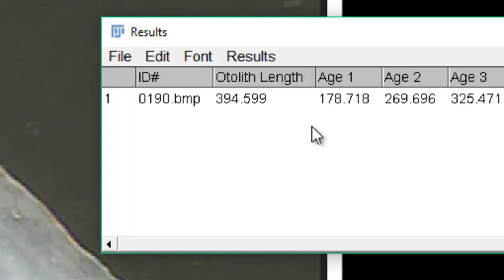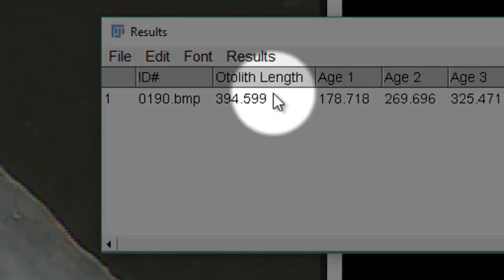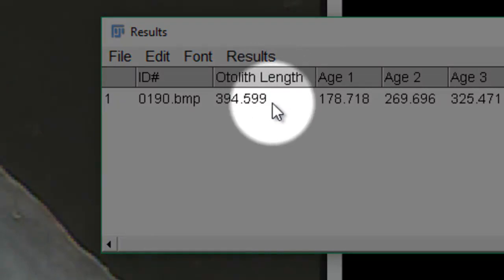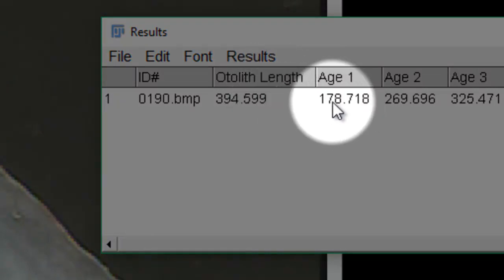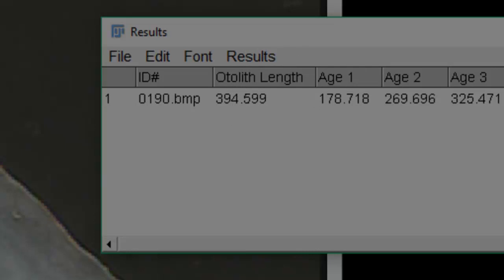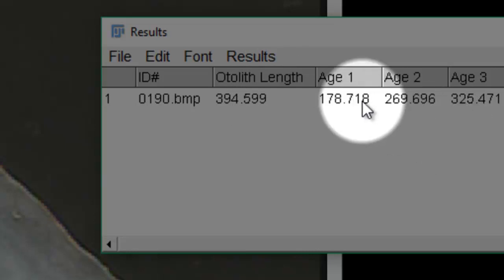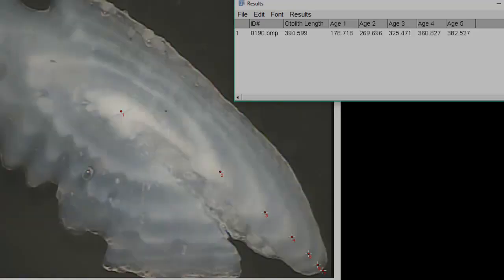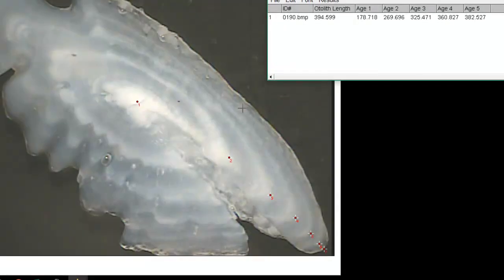Here is how the macro makes your life easier: it puts the otolith length in the first column. These are unitless numbers — just in pixels — because we're looking at the ratio of one to another, so units don't matter. If we come back to the image, you can order the distances from shortest to longest. The shortest distance will be annulus one, and the maximum value is the length of the otolith.